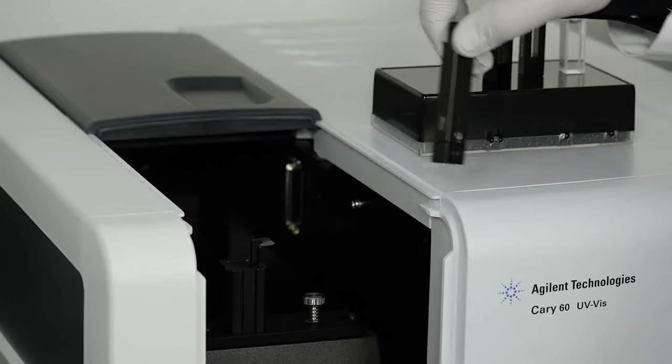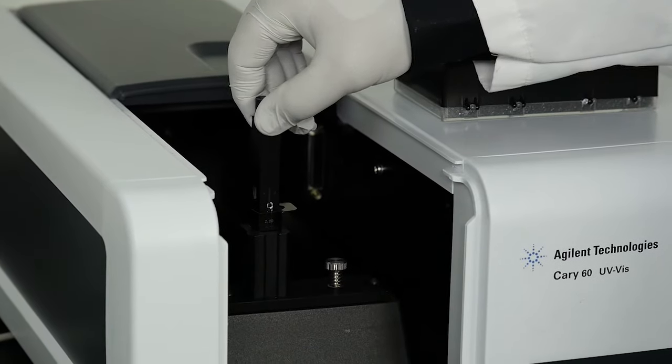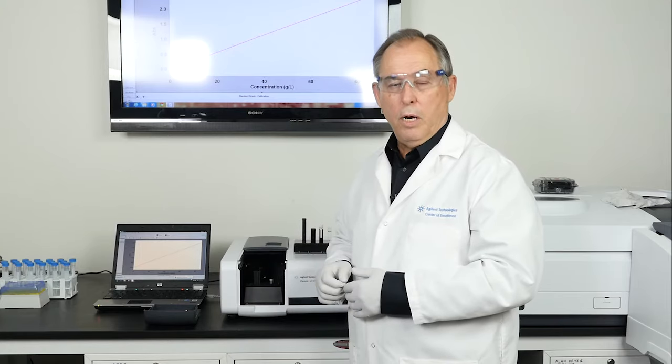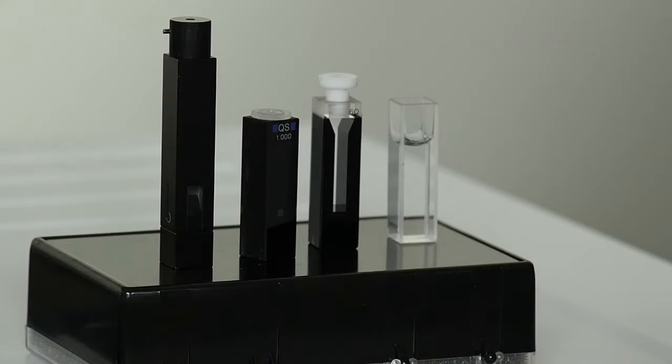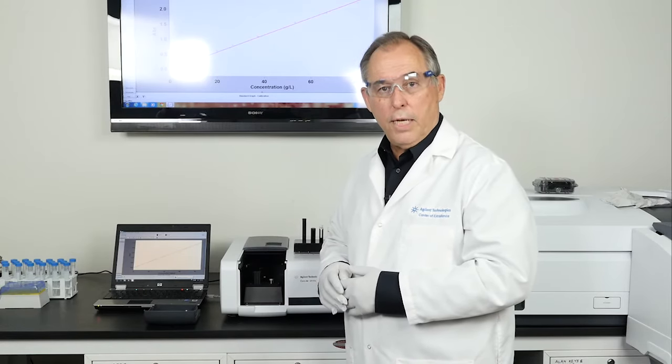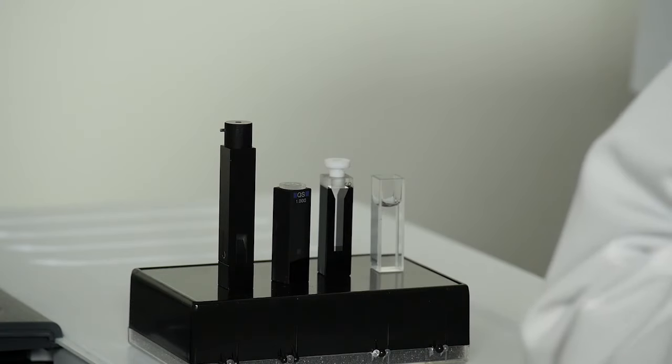So as you can see from the experiment, the first three transmitted the same amount of energy - in fact, all the energy that was coming from the instrument. The fourth cell, the tray cell, had a reduction, but when you consider that you were only looking at one microliter sample, you would expect a little drop-off. But you still have much higher signal-to-noise than you would with a standard designed instrument.